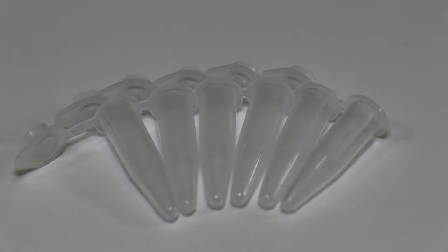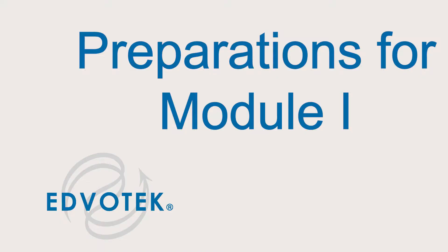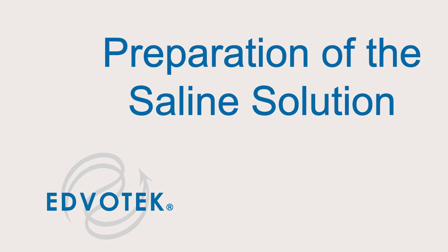You'll also need 0.5 milliliter snap top tubes and 0.2 milliliter PCR tubes. Preparations for Module 1: preparation of the saline solution. Step 1: dissolve all 8 salt packets, approximately 4 grams, in 500 milliliters of bottled water.